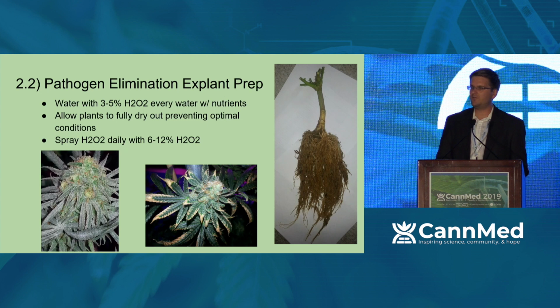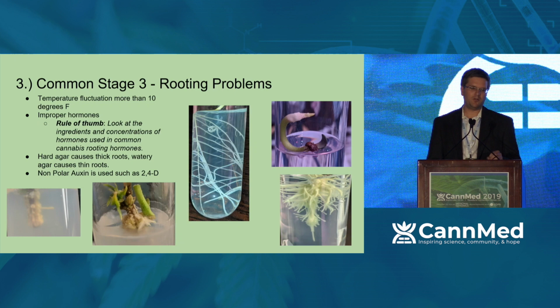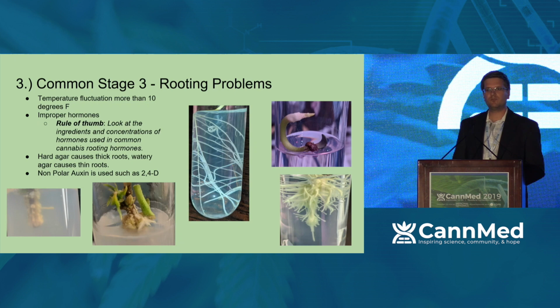So if you look at common stage 3 rooting problems, one of the biggest ones I ran into at first was that I was using T5 lights, those small little bulbs essentially, and my temperature fluctuations would change more than 10 degrees, sometimes up to 20 degrees between day and nighttime temperatures. I realized very quickly that was one of the biggest limiting factors and switched to complete LED lights for my tissue culture. It almost overnight fixed my problem, all of them, which I couldn't believe. Just the temperature fluctuation alone, potentially some of the light created some of that.